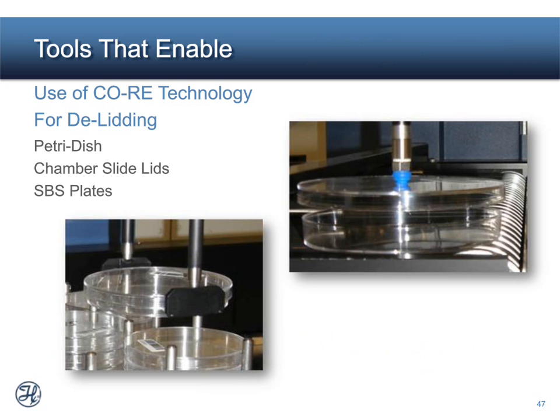So here's a couple pictures, examples of different tools core technology can use. We are able to manipulate lids on labware and move those around, and that's really important with cell culture because all of the labware needs to be lidded to keep it sterile, as well as we can move labware around the deck with core grippers as well that you see in the lower left.